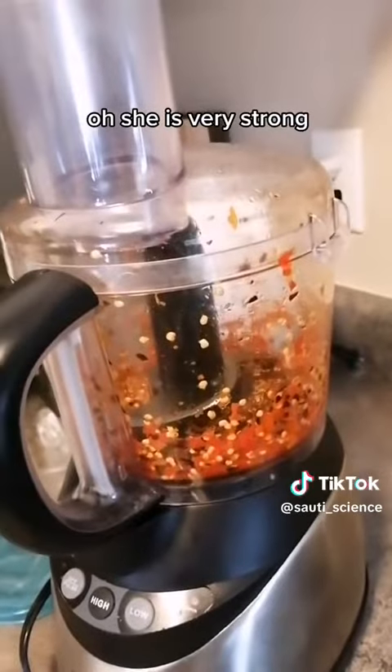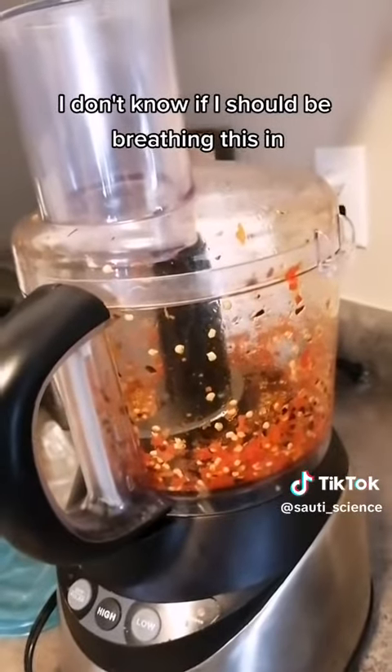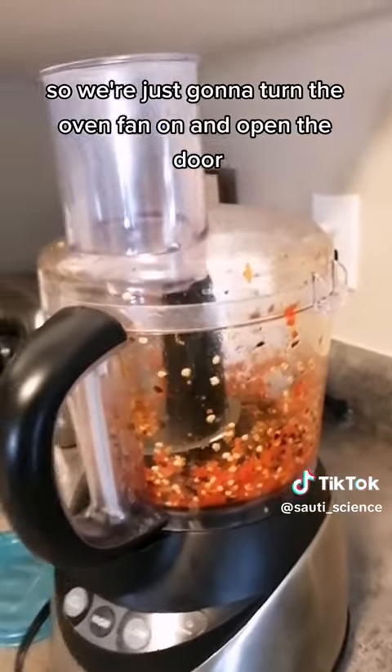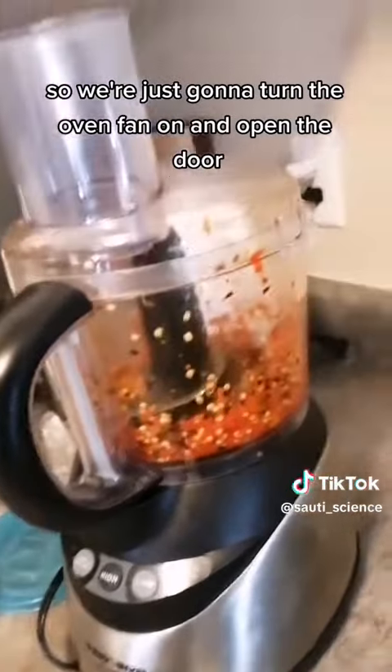Oh, she is very strong. I don't know if I should be breathing this in, but I obviously don't have a fume hood in my apartment, so we're just gonna turn the oven fan on and open the door.